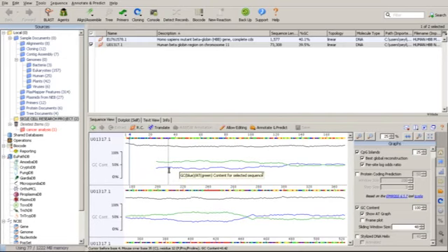Now it is for you to understand that this graph is making us understand the expression level of the GC content and the AT content. Either GC content is expressed here, or AT content is expressed. As you can see here, AT is green, content for selected sequence. So this is AT content, which is the green line. That means it's more expressed, above the blue line, which is GC content. So that means entirely this region from here to here.